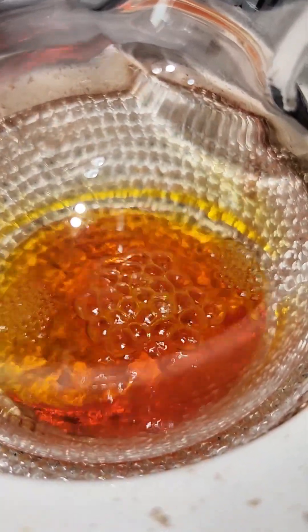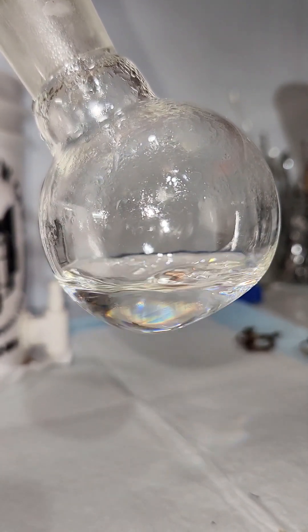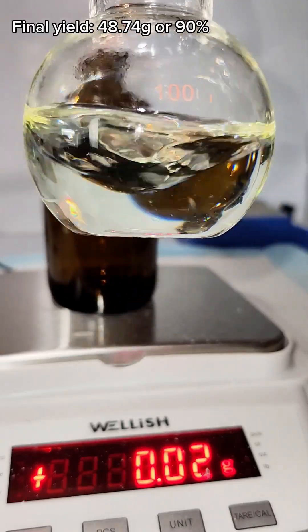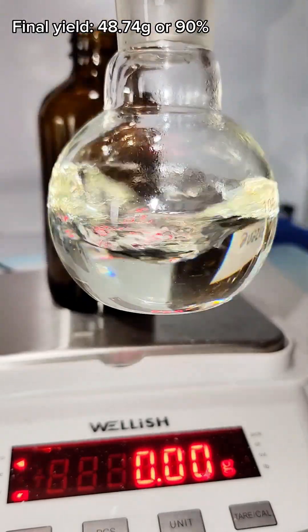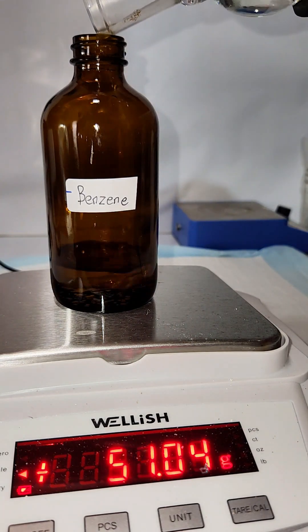I intend to use it to make the indicator methyl red, as well as aniline and a few aniline derivatives. Anyway, in the end my yield was 48.74 grams, which is a 90% yield if you round up. And that's the entire process.